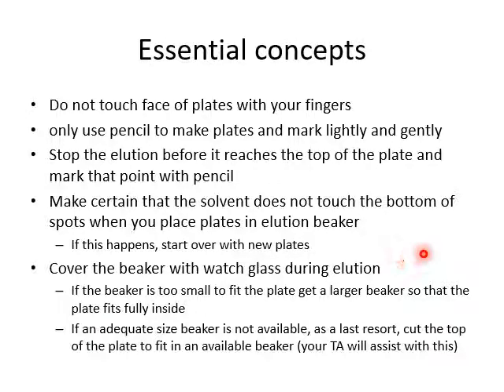Last few things to keep in mind. Do not touch the face of the plates with your fingers or with your gloves. Only use pencils to mark plates, and you should mark them lightly and gently. You stop the elution before it reaches the top of the plate, and you mark that point with a pencil. You draw a line of your solvent front. You make certain that the solvent does not touch the bottom spots when you place plates in the elution beaker. If this happens, you need new plates.